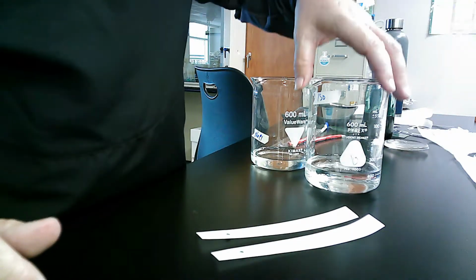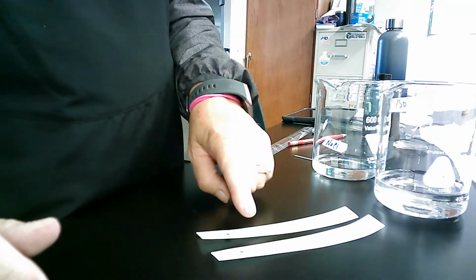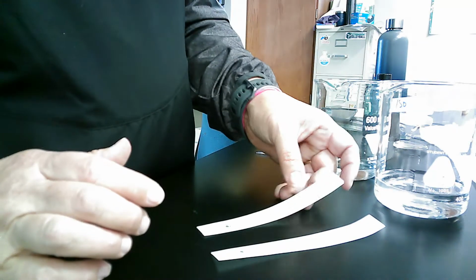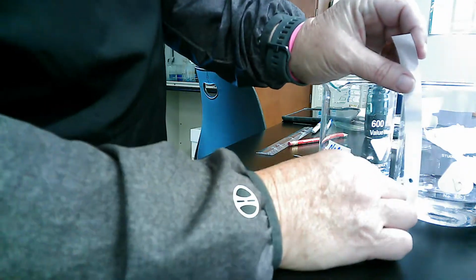It's really kind of arbitrary because what matters is that your paper is going to hang in your flask, but you can't have your dot touching the solvent. The paper will get wet as the solvent travels, and that's how it's going to separate, but you don't want the dot that we made sitting in the solvent. So you have to make sure that it hangs above. The trickiest part about this is getting it set into the right position. So I've got my two papers, I've got my solvent. I'm going to think about how high I need it to be.